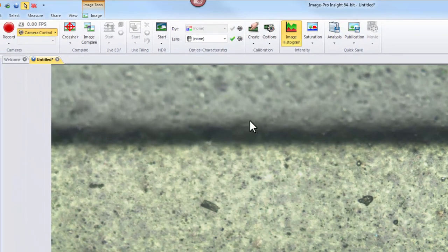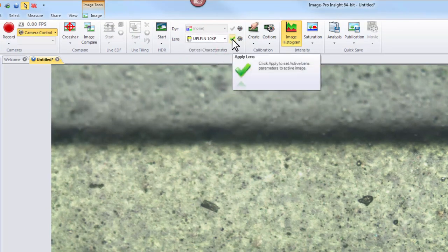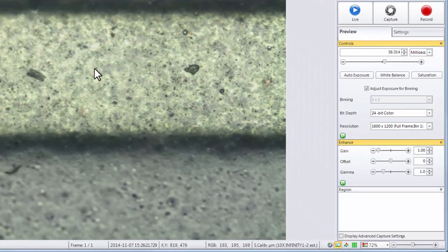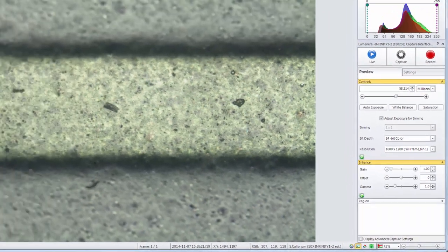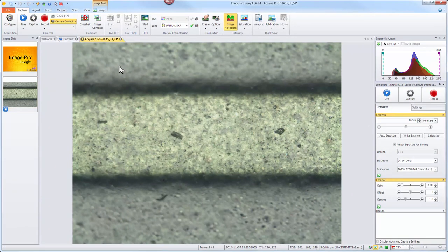Now that your lens has been defined, the optical characteristics group will show your lens in the dropdown. By selecting this lens and hitting the apply button, any image that's open in the interface will automatically receive the calibration as you see below. Any new capture will also automatically receive this calibration upon acquisition.